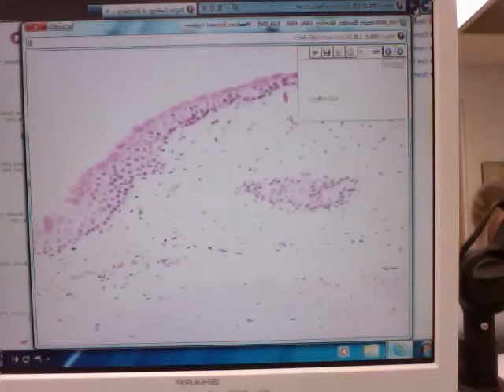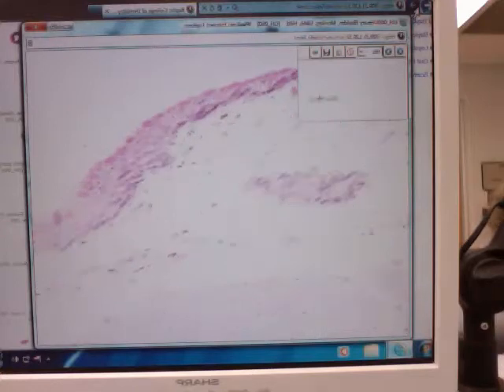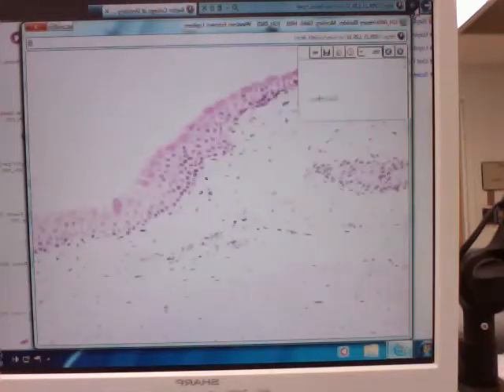And what you'll see here, almost always, there are rare exceptions, but almost always when you look directly beneath an epithelium, you'll find loose connective tissue. So you'll see plenty of collagen fibers, but lots more cells than what you would see for dense irregular. So you go through here, you'll see lots of cells, not as many fibers. You don't see the packing in of the fibers like you do in other areas. Okay? And typically when you look around like blood vessels, these are all small cut pieces through blood vessels. All this area in here around these blood vessels are also examples of where you would see some loose connective tissue.